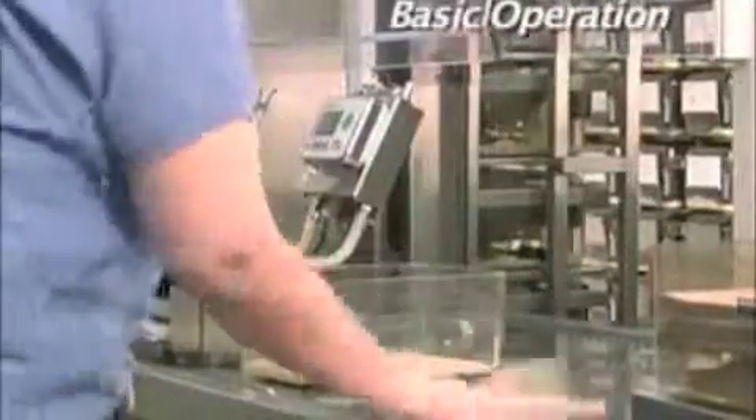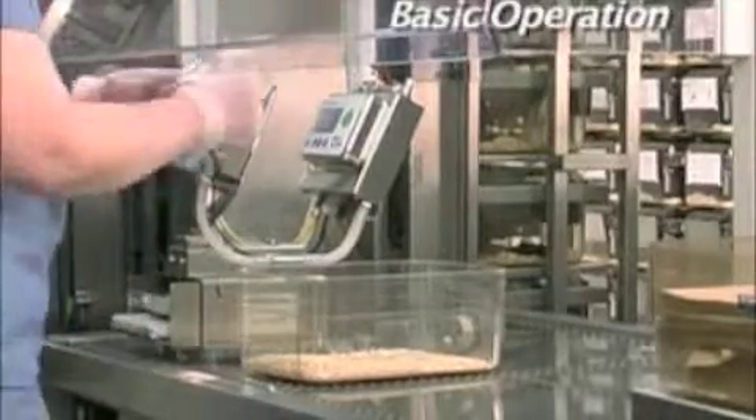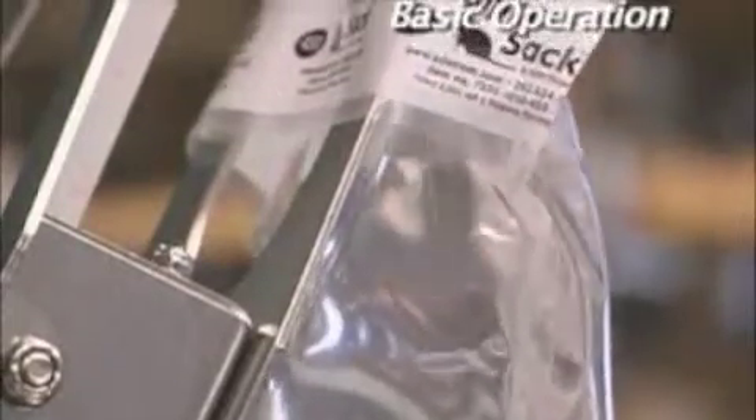Operation of the Edstrom Sipper Sack couldn't be easier and can be done using only one hand. Simply remove the sterile Sipper Sack from the packet and position on the filler station. Engage the filler head in the reinforced fill port on the Sipper Sack and the fill sequence will begin automatically.